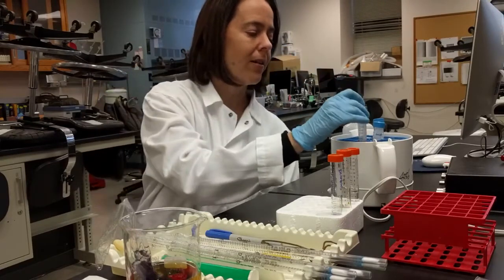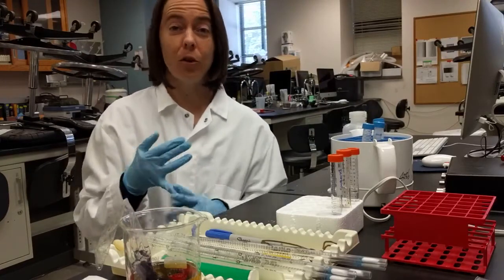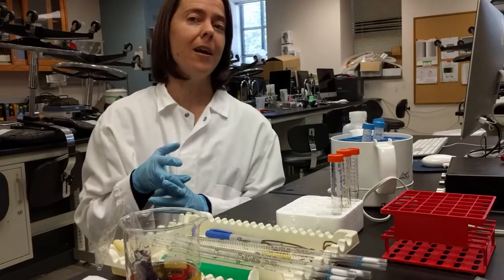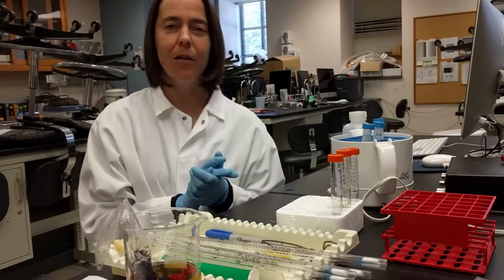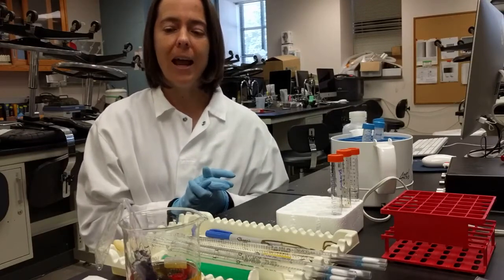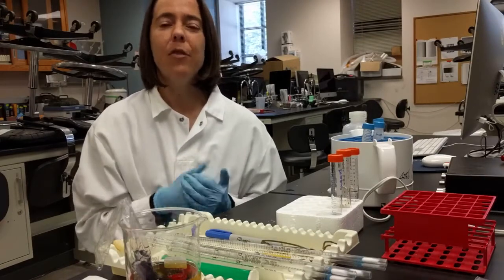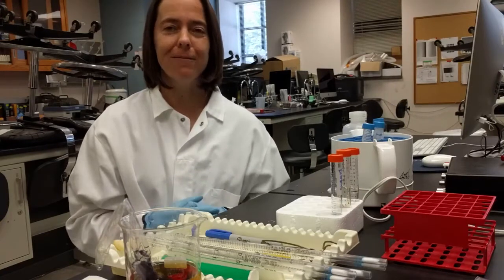Okay, so think about all the color changes that you've seen, and what does it mean in terms of starch diffusion and glucose diffusion and the I2KI. Okay, so that's it. So now I'm just gonna clean up all of this. None of this is toxic, so it can just go in the sink and in the trash. And you should go ahead and analyze your data, think about what it means, do the worksheet, and then write your lab report. All right, hope that helped.